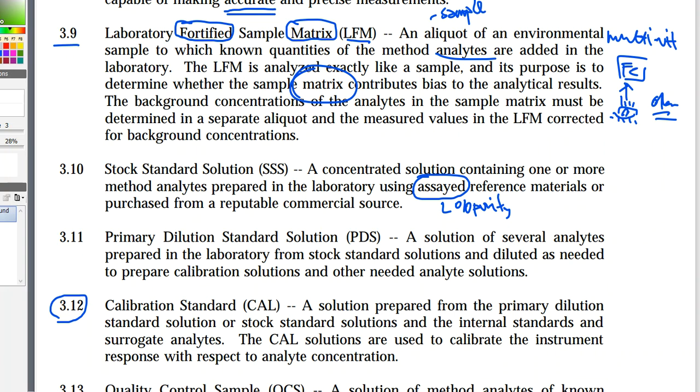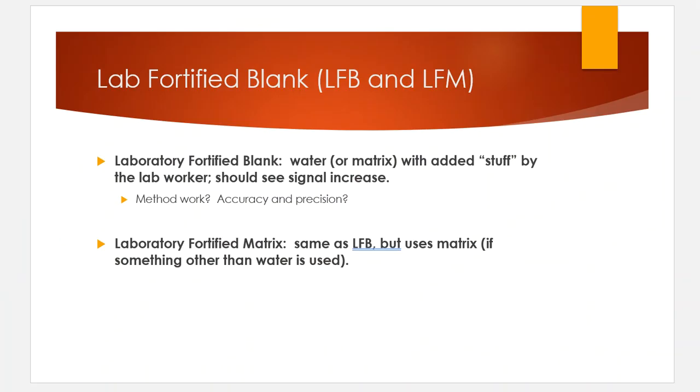That's what that means. So if I do have to make it from scratch, I'm going to use some type of iron compound probably that has a percent purity assigned to it, and I know what I'm using, the purity of that, and hopefully it's really close to 100%. It will never be 100%, but hopefully it'll be really close to 100%.